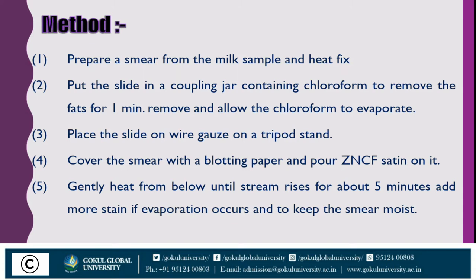After evaporating the chloroform, place the slide on a wire gauze. Apply blotting paper on the smear, and put ZNCF stain on it. Provide heat until steam arises — when steam arises, stop the flame.